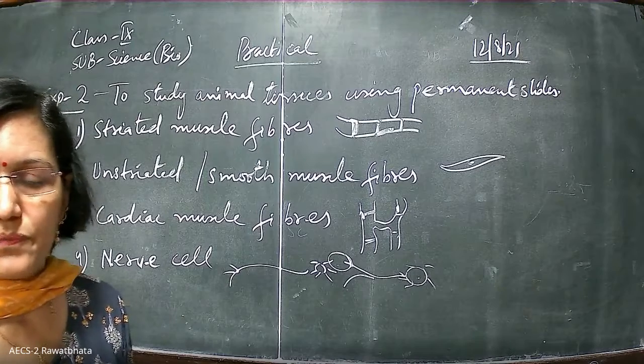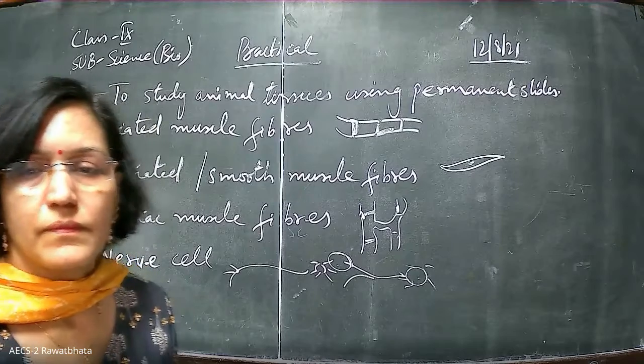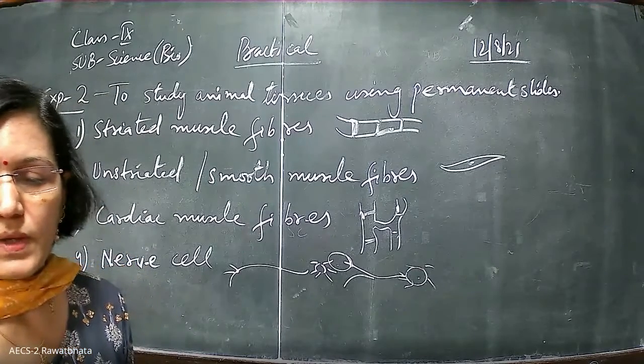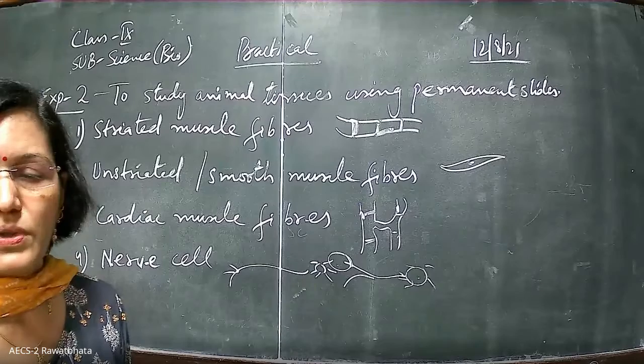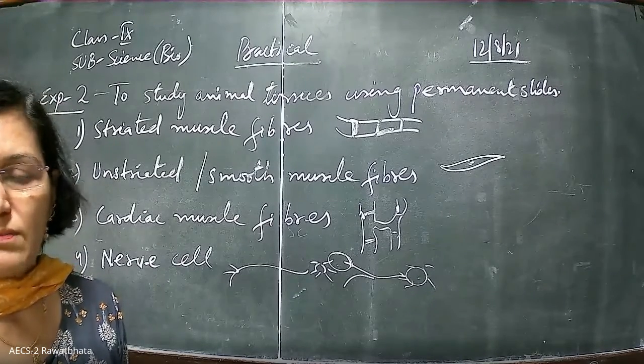And here we go. And here I share the slide for the striated muscle fiber.